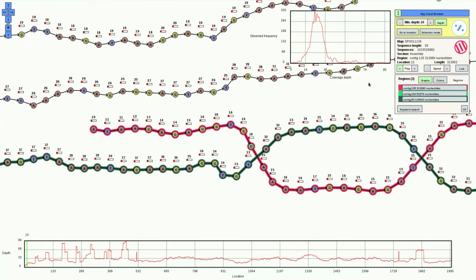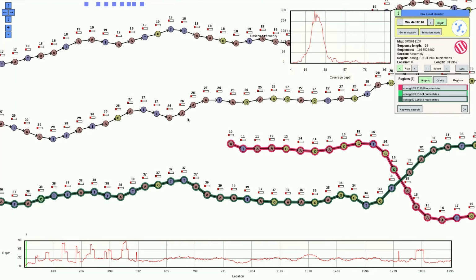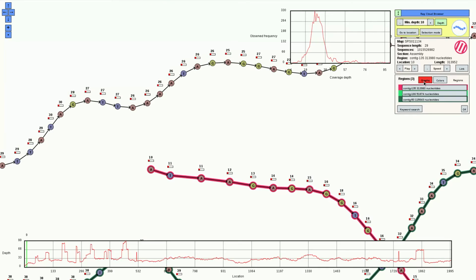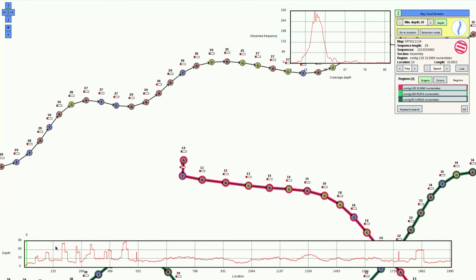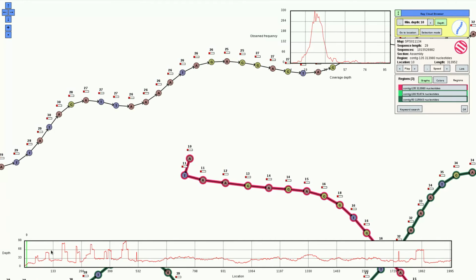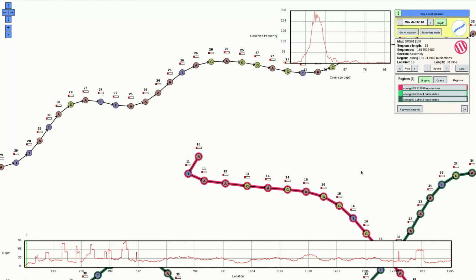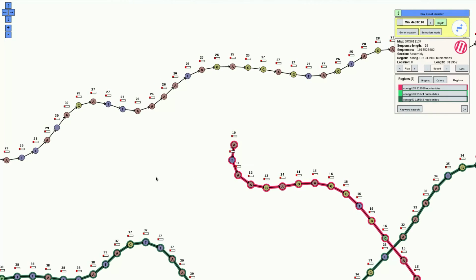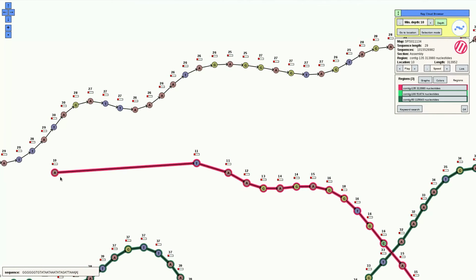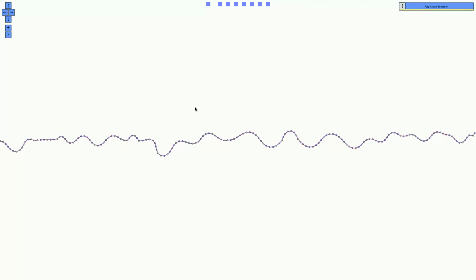We have now reached a dead end in the graph. A dead end means that at this location, there is no more sequencing data available. Pressing the graphs button shows the sequencing depth at each position in the path. With this, we can see the drop at the end. A dead end can also mean that the assembly software went the wrong way. I showed the end of a DNA path in this graph with Ray Cloud Browser.